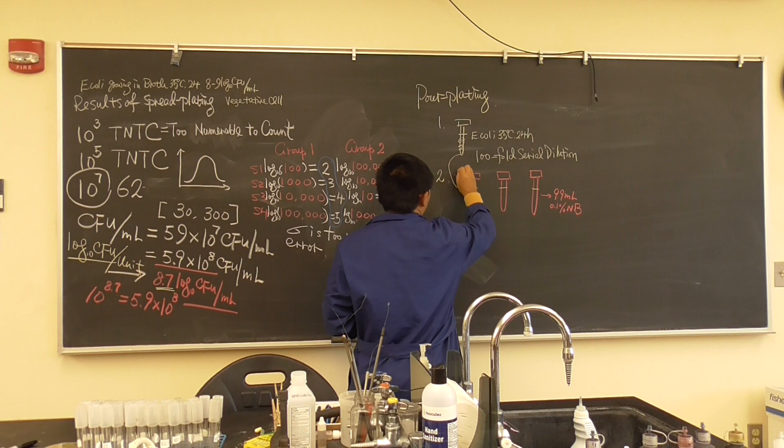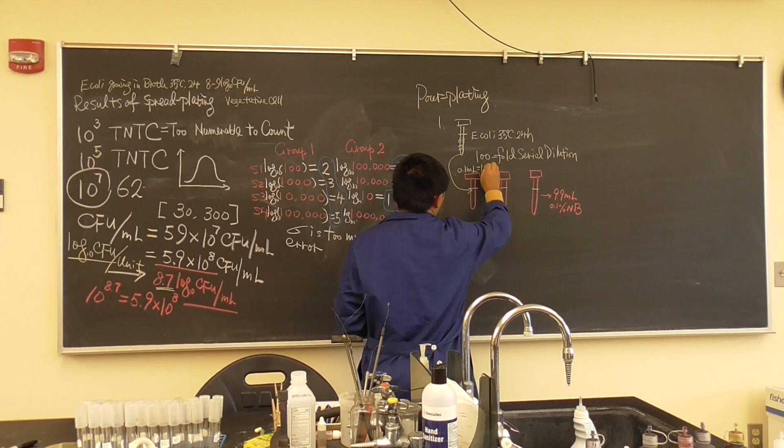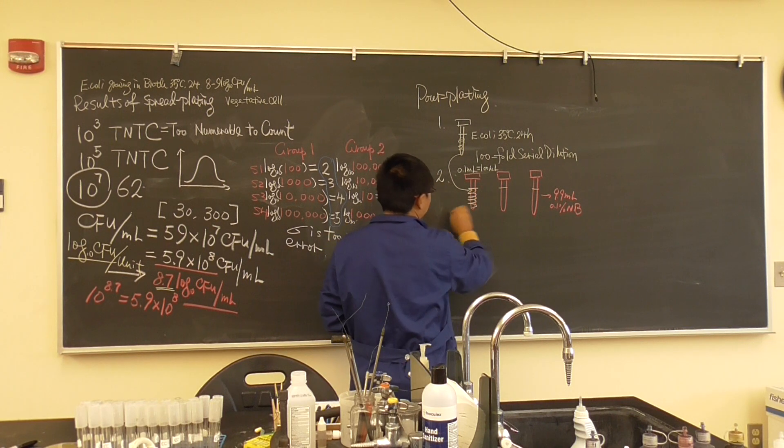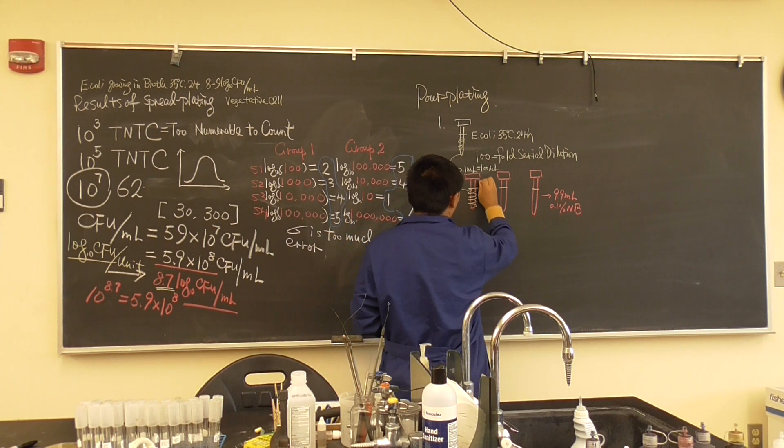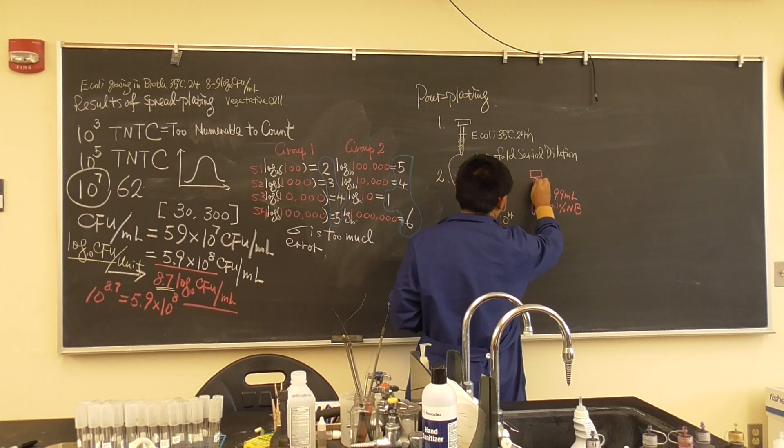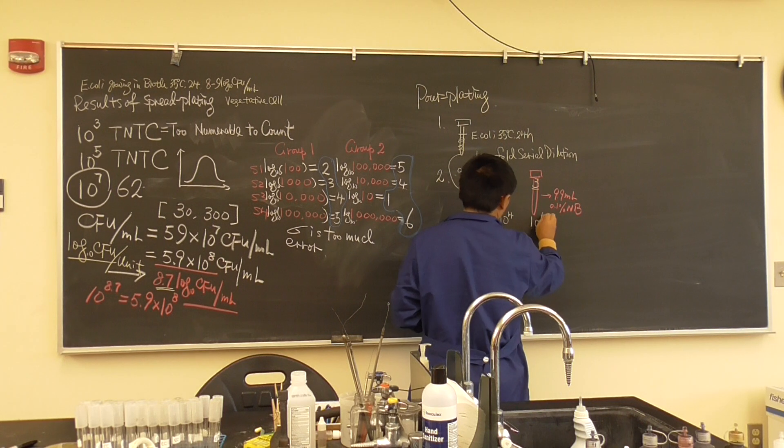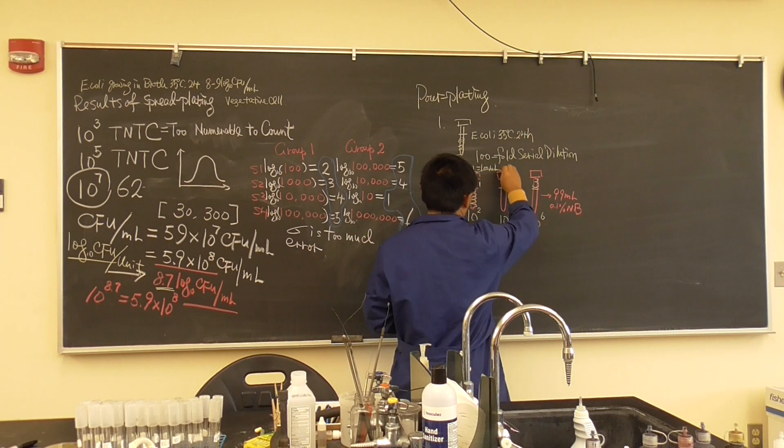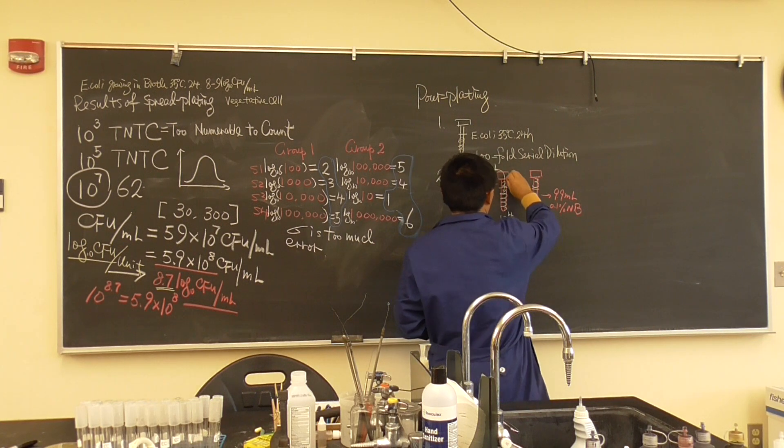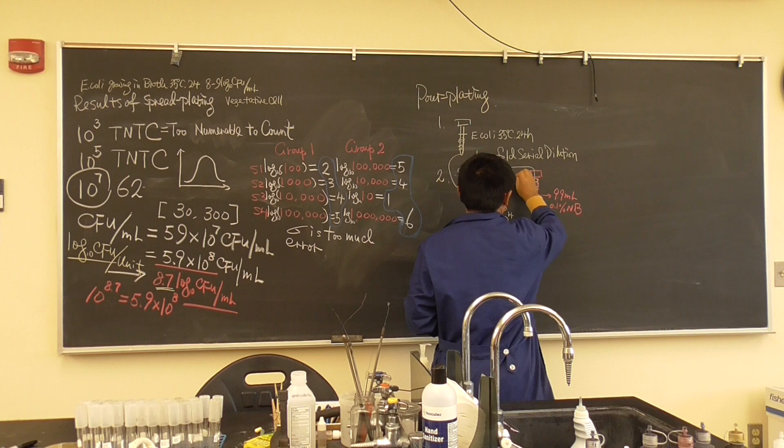Under the original culture, we're going to add in 0.1 ml, which is 100 microliters using pipettes, and we mix it very well. So that tube number one is 10 to the 2, tube number two is 10 to the 4, tube number three is 10 to the 6. The same thing. So there we mix very well, we transfer another 100 microliters, go to the second tube, and we mix very well. So we mix very well, we transfer 100 microliters, go to the third tube and mix very well.